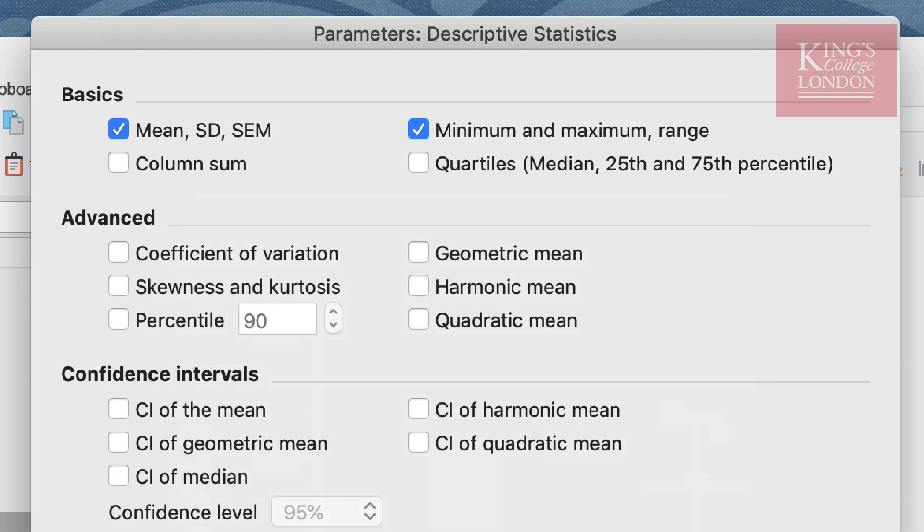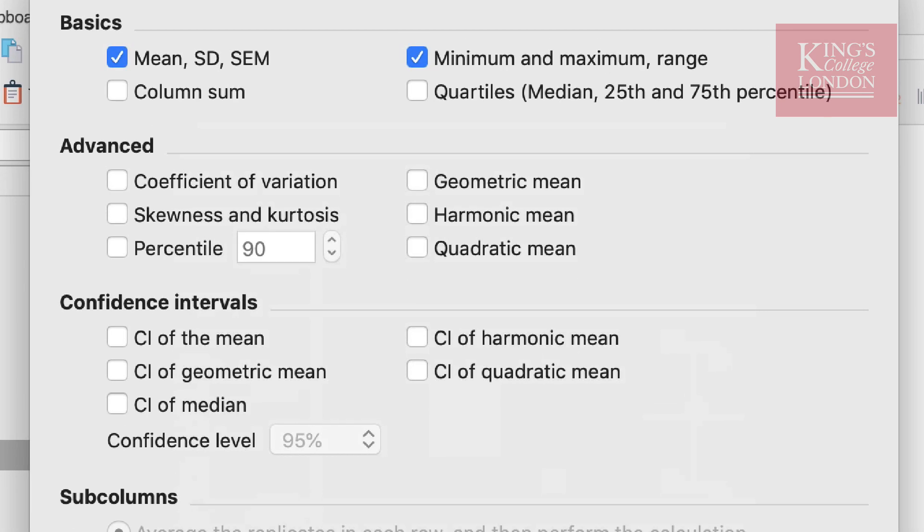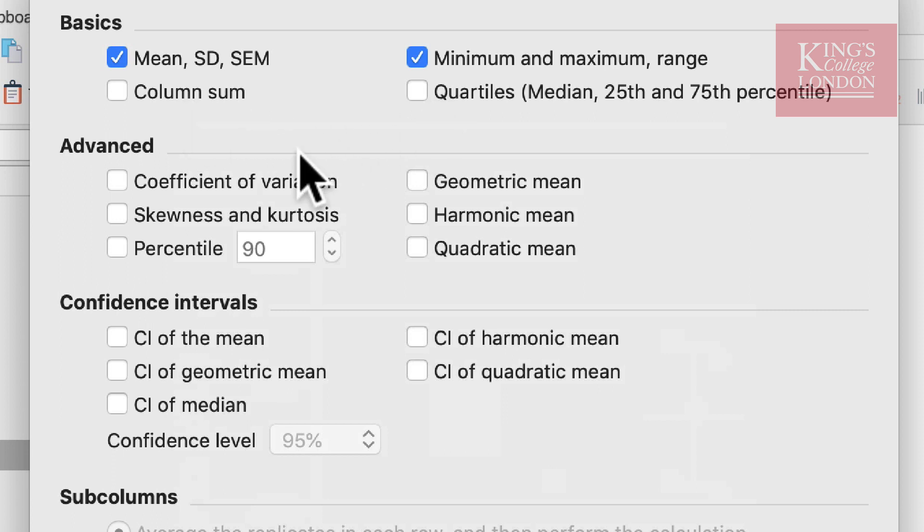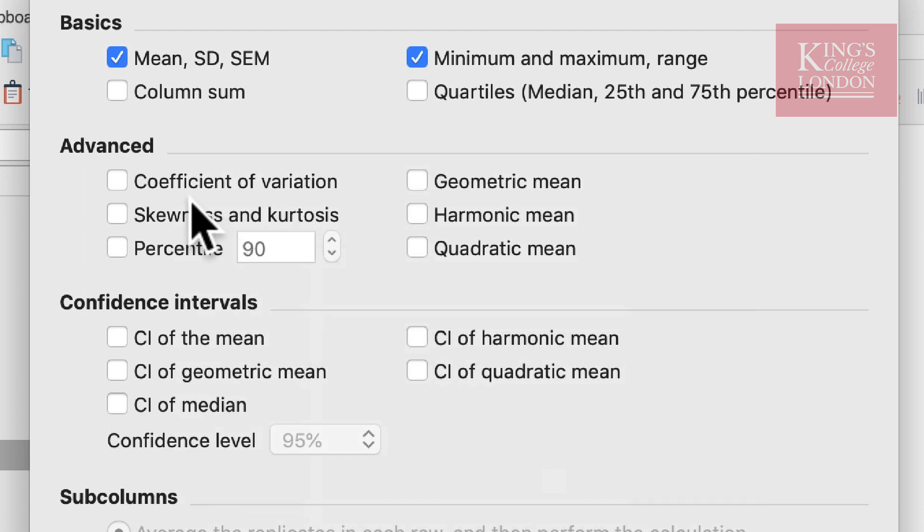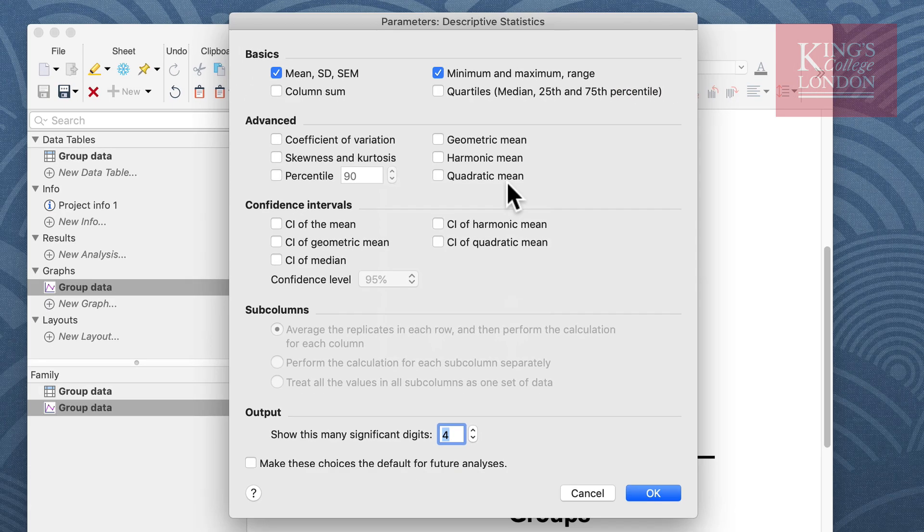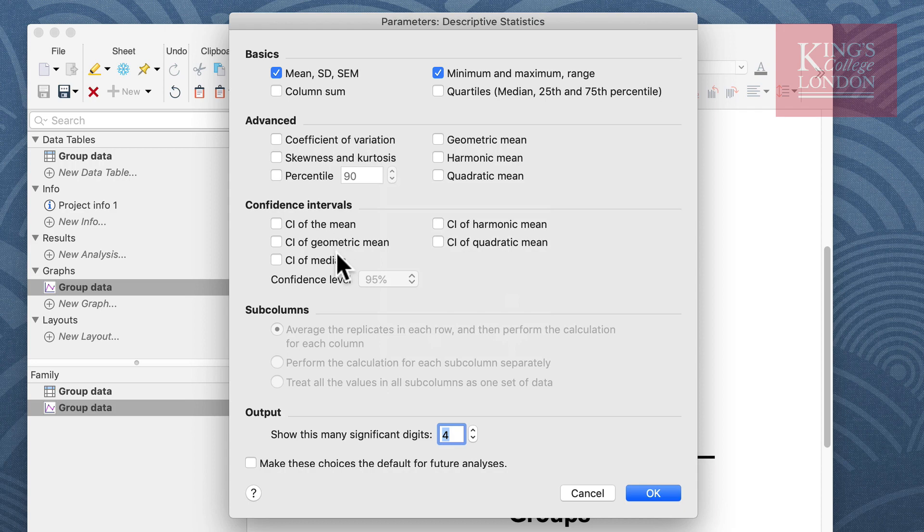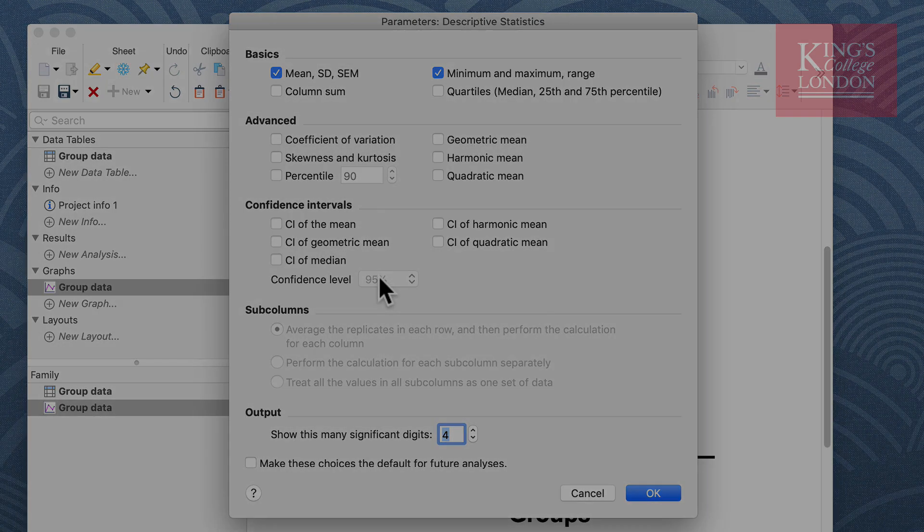In addition to these basic options you have a number of other options including the sum of your columns, the quartiles, and in the advanced and confidence interval option you can look at coefficient of variation, geometric means, harmonic means, quadratic means, and you can set confidence intervals at whatever level you want.